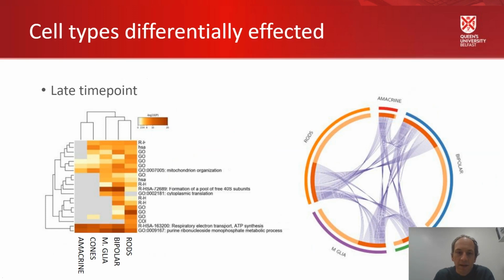So we can see that shown in this image. If you look on the left-hand side, we've looked again at five of the more numerous cell types: the rods, Muller glia, but also the bipolar, the other photoreceptors, the cones, and amacrine neurons.